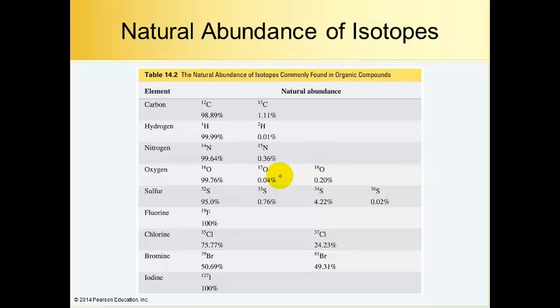Nitrogen, oxygen, sulfur, and then we really gain a lot of information from these two here, chlorine and bromine. That's mainly because chlorine and bromine give an M+2 peak. That's going to be something very characteristic of molecules that contain bromine and chlorine, whereas for these up here, we mainly think about M+1.